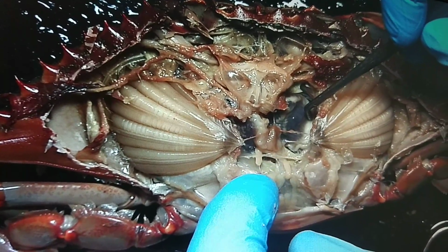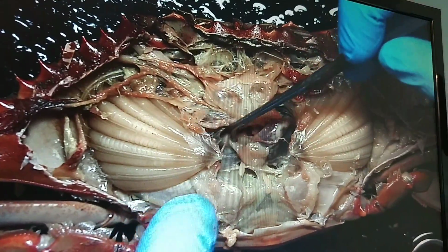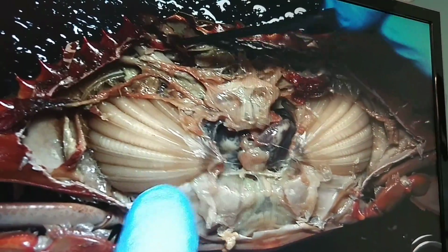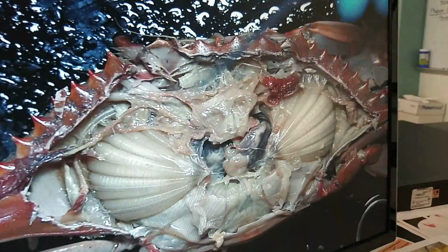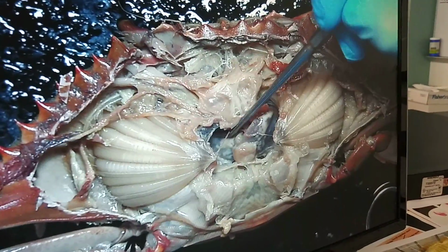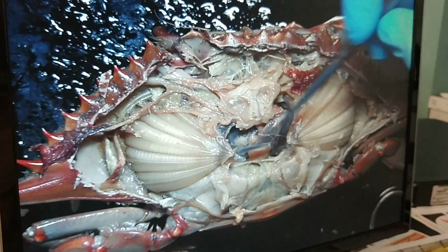Is it like digestion stuff? I think this is all part of, no, the kidneys are going to be, like, the reproductive or excretory stuff is going to be up by the antennae. Honestly, I'm drawing a blank on these things right now. Do we need to know them? No. Alright, cool. Move on.